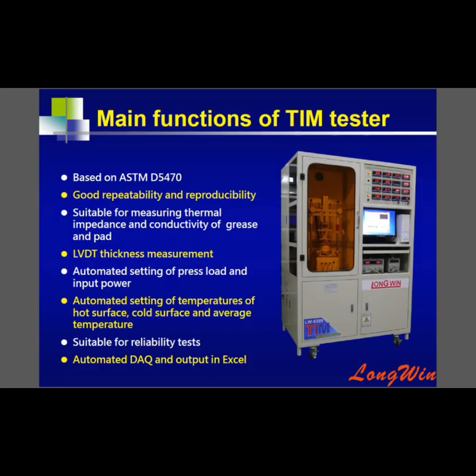And the fifth point, the tester will have automated setting for press load and input power. The sixth point, and also we can set the temperature of hot surface, cold surface, or average temperature with automated setting.